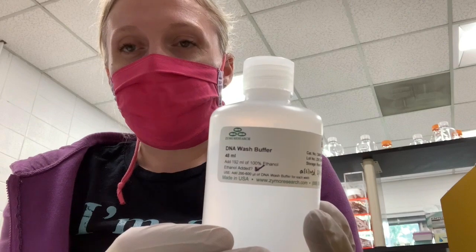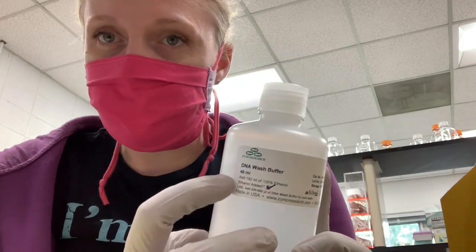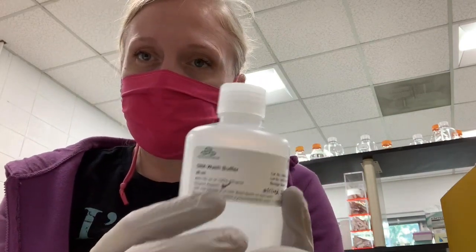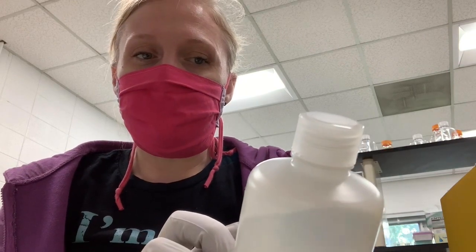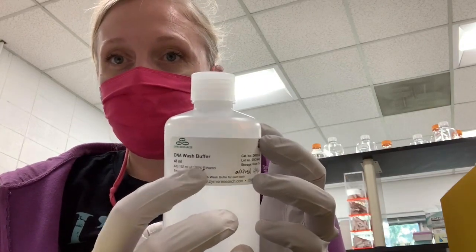This is supposed to have ethanol added to it, and as long as this box is checked, where it says ethanol added, you're good to go. If you opened a new box or had a new bottle of this and this box weren't checked, you would need to follow the instructions on the bottle, and this says to add a certain volume of ethanol. Once you do that, you can check it off, and then that bottle is ready to use.